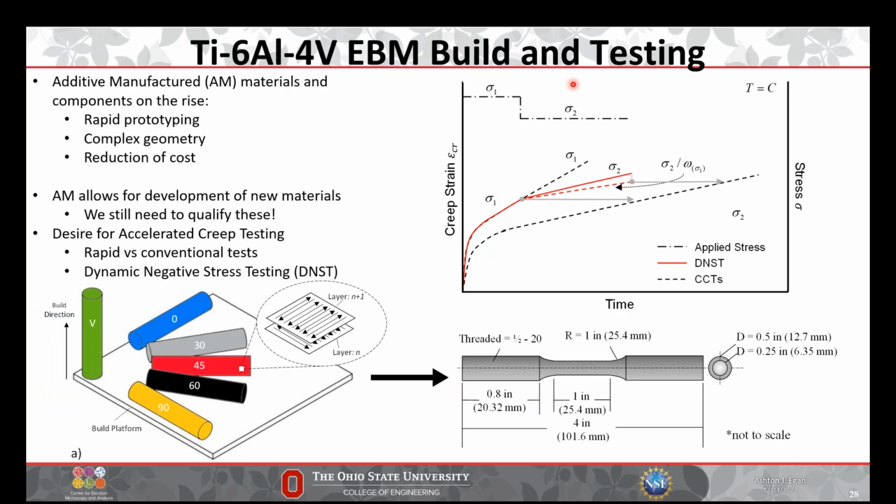So just to give a quick background on what exactly the problem is that we're trying to solve. They have some Ti-64 electron beam melted builds. So basically you raster an electron beam to build up layers of material by introducing powder, melting them, more powder, and then you just do this for many layers and make a thick sheet of metal, basically, or a block of metal. And so additively manufacturing like this is gaining popularity. I mean, has gained popularity.